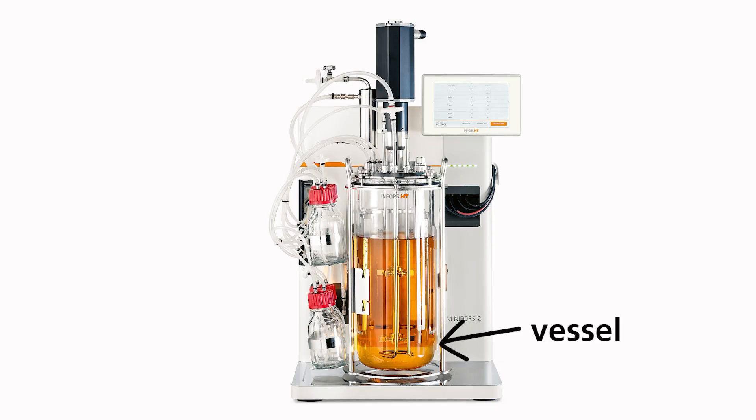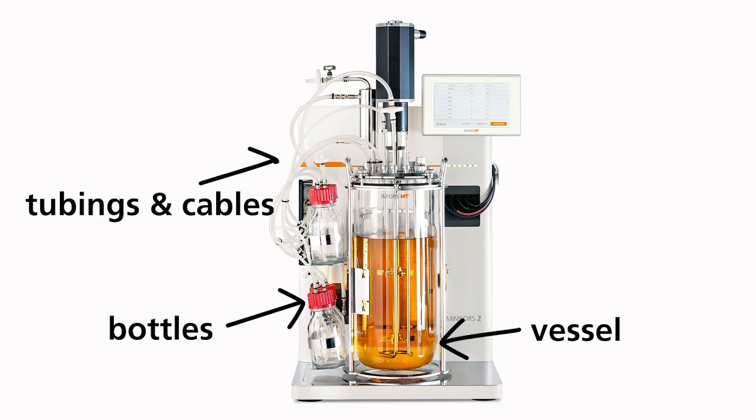The components are the vessel, the bottles, tubing and cables of course, the sensors, and much, much more.